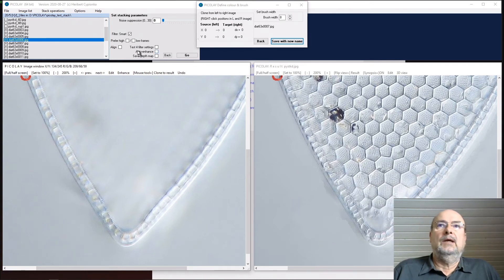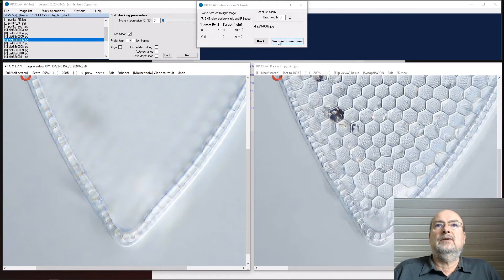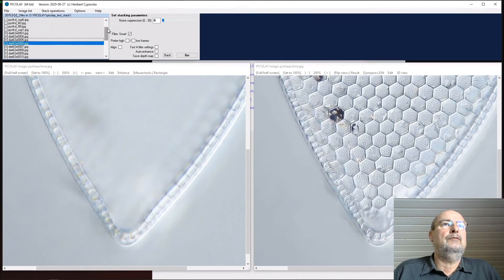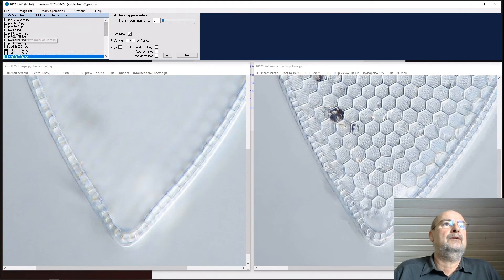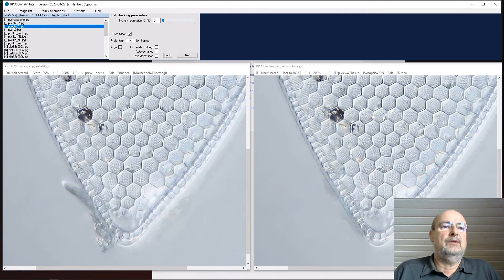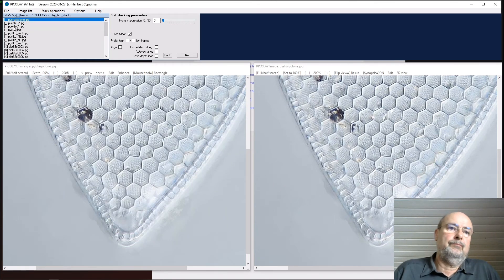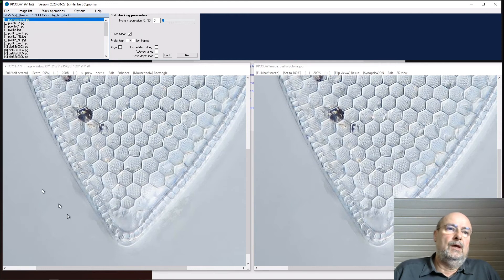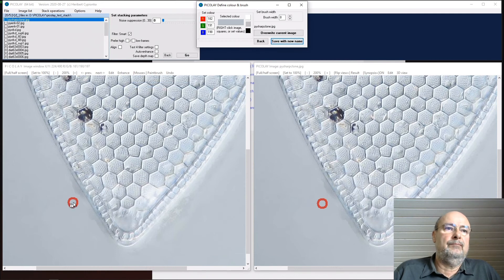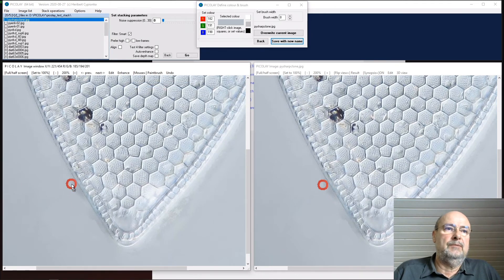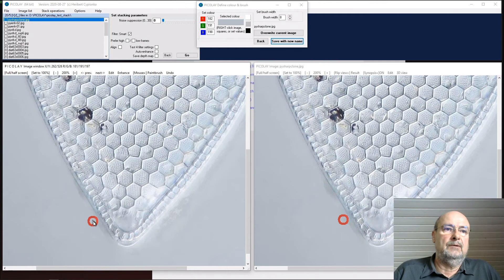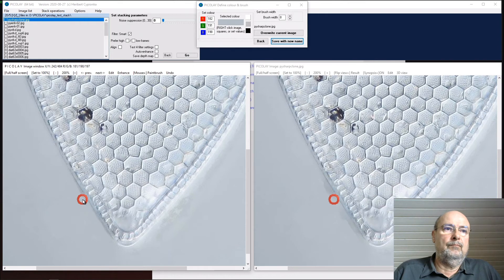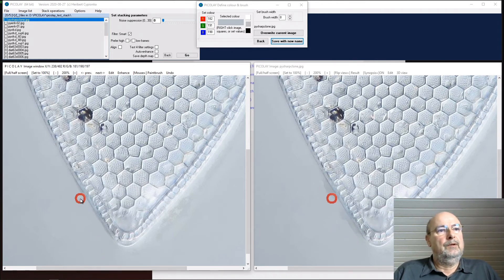No problem. I would say save with a new name again. So we have further enhanced images: this one, this one, this one, and this one. Now I would go back here, take the paintbrush again, use my color from here, and clean the background color.